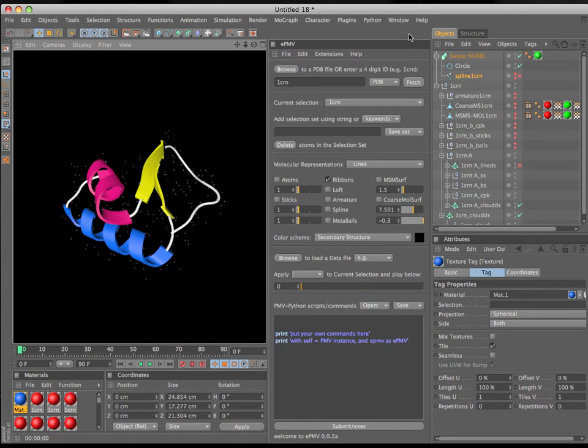That shows you all the basic features of the molecular representations panel. I showed you a little bit of the selections palette as well as the browsing palette. I'll show you some of the data features in the data panel and then some of the scripting next.